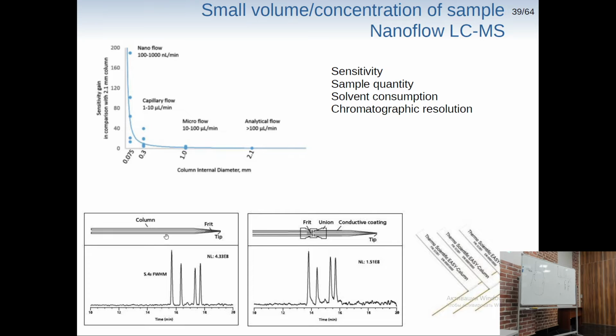And this is a newer addition where your source is actually the column itself. As you can see, you will get lower noise, higher intensities, and the peaks will be separated better. So, nowadays, mostly proteomics is done in the so-called nanoflow regime with such small columns, which requires quite a small amount of your starting material, and sensitivity would be even higher than what was possible with previous ways.